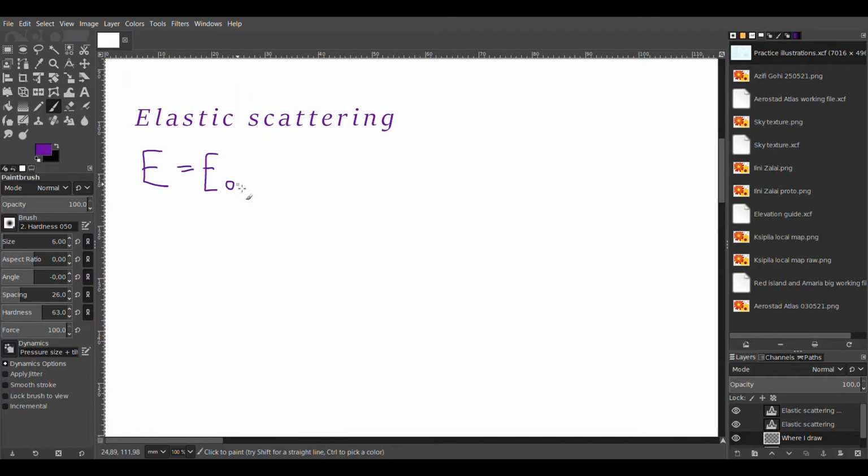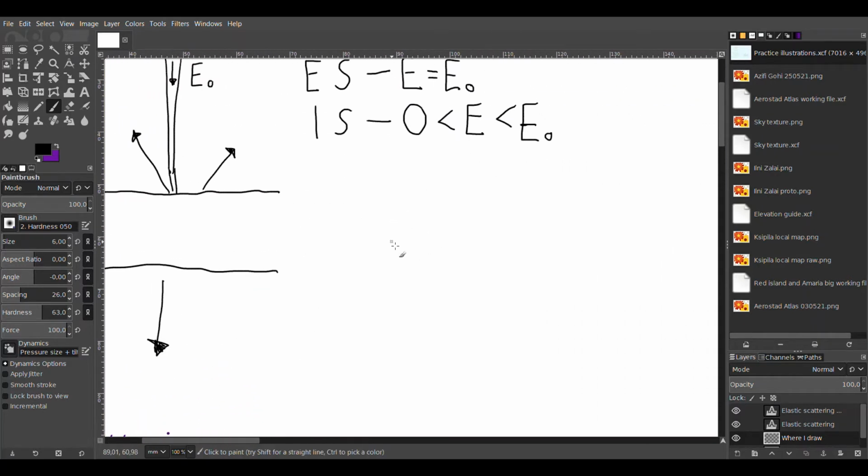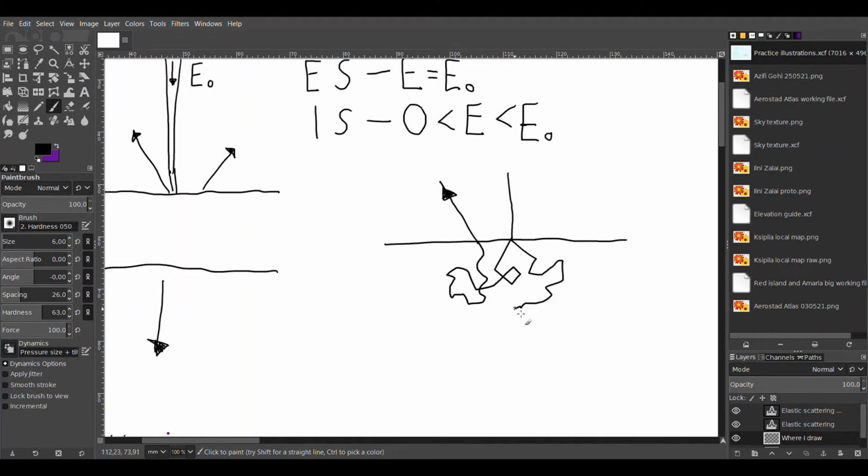This is when I pick up my notes. All kinds of scattering I can put here. Now it has the surface, and you have the beam come down here, maybe going here, here, here. Some beams resurface and go out here. Something I should note here is that some just disappear into the material somewhere. So not everything comes out again.